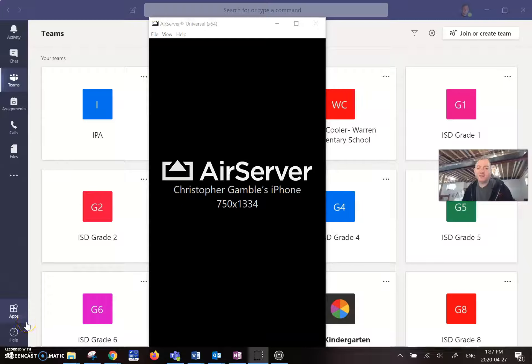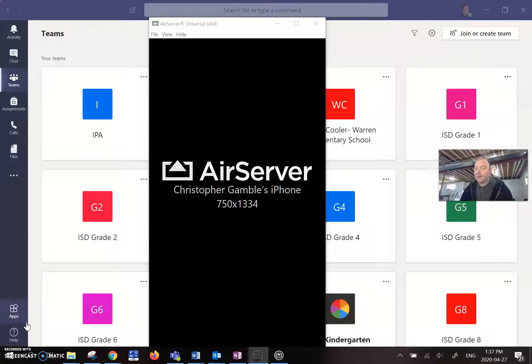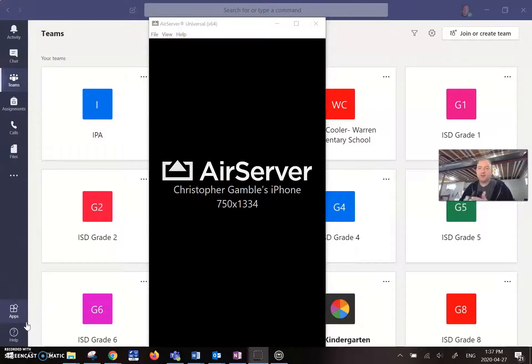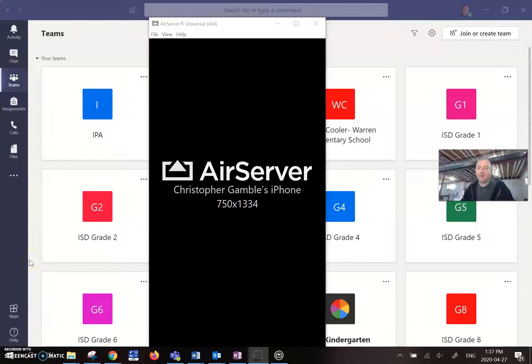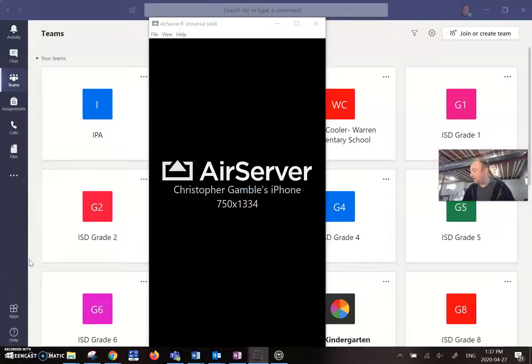All right. Hello, everyone. I'm here to show you how to use a microscope attachment that you can get fairly cheaply on Amazon to change your phone and AirServer into a microscope. So you can do this through virtual learning environments or on your screen in your classroom.